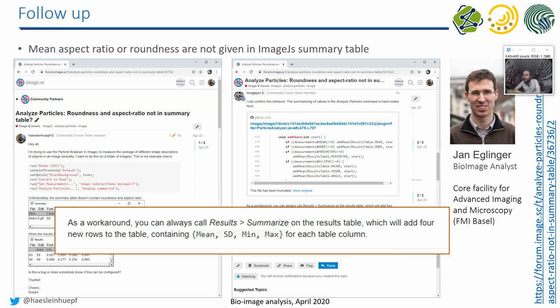And with that, you get four additional lines in your results table which calculate the mean, the standard deviation, the minimum and the maximum. And in that way, you can actually get the mean roundness and the mean aspect ratio.